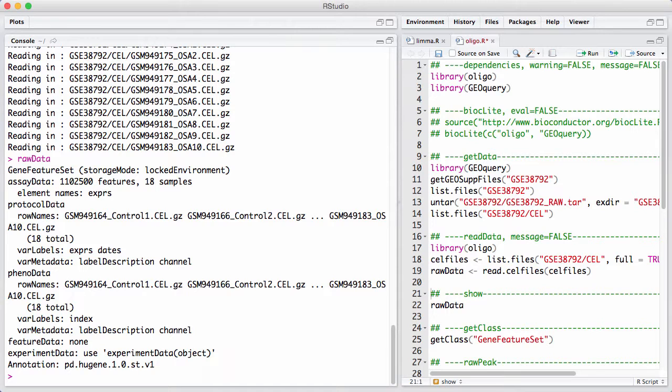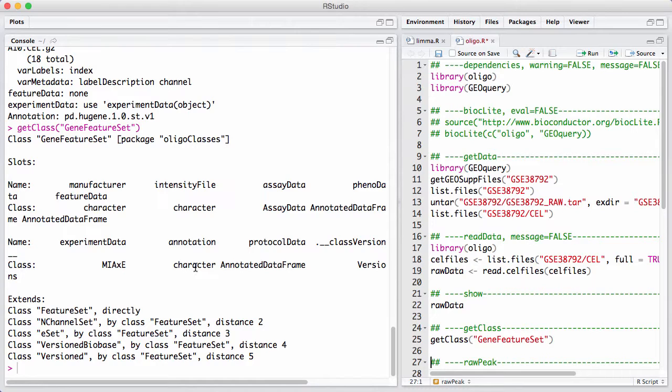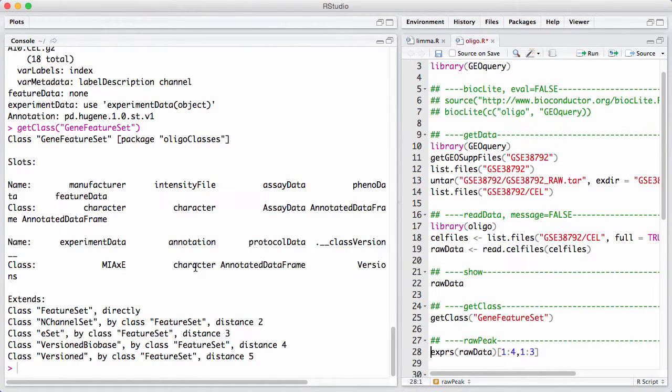Let's look a little bit at this gene feature set here. We can see that there are some stuff here that looks very much like an expression set or ESET. Then we have some additional things like manufacturer intensity file that's new. And this here is really a way of representing these links. As I said before, we have many probes that measure a single gene. And all of this is taken care of in this feature set.